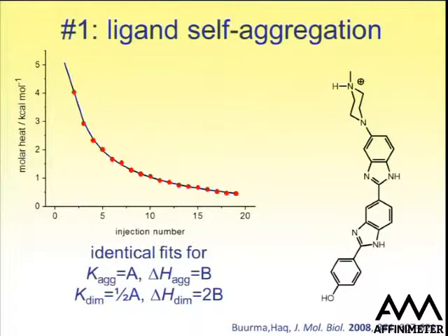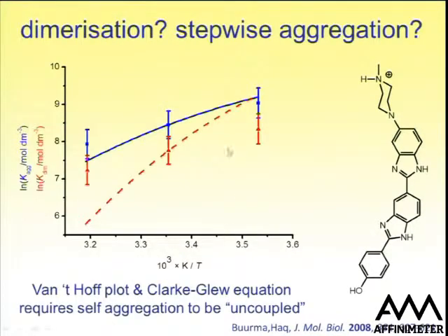But this actually gives you a way out, because we've seen the Van 't Hoff equation before. We have a factor of 2 difference between these 2 equilibrium constants. And the good thing about that is, as soon as we start taking logarithms, that turns into a simple 0.3 of a step on a logarithmic plot. So that's what we've done here.